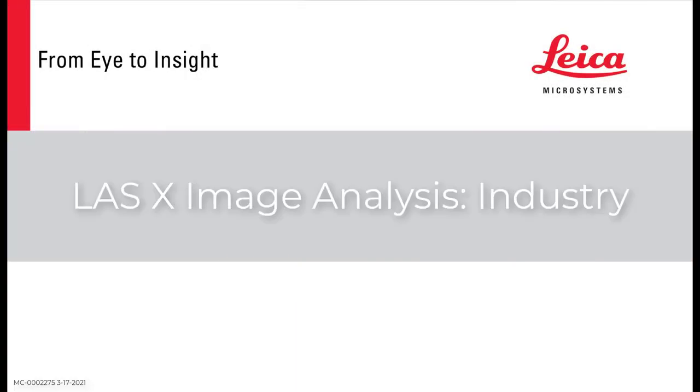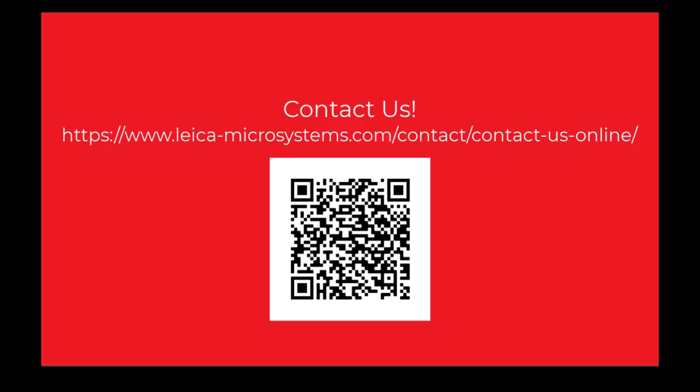Welcome to the Industrial LASX tutorial video series. Today we will be talking about LASX image analysis for industry. We will be focusing on the basics of this software module, and if you have any questions related to your specific application or questions that have not been covered in today's video, please reach out to your local Leica representative.